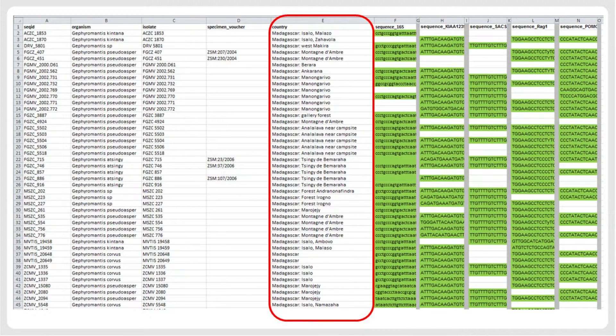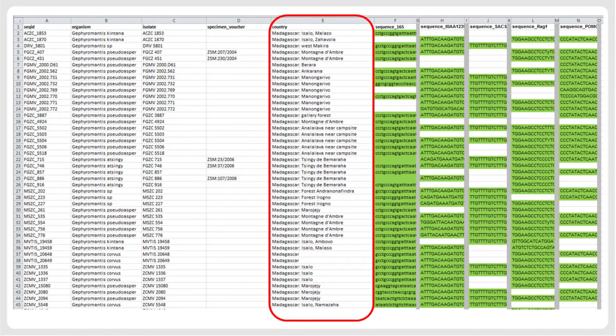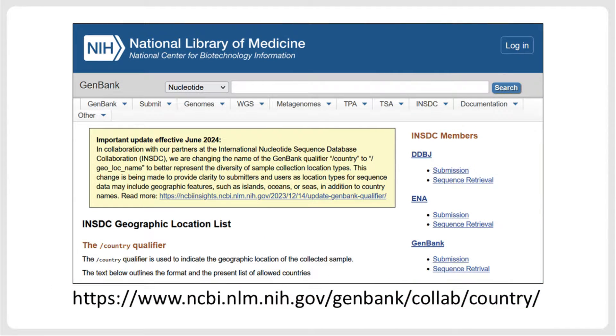In addition to the information on isolate or specimen voucher, it is also necessary to specify information on the geographic provenance of the samples. This is done using the source modifier called country. Here, the country is given first, followed by a colon and the specific locality, which should always be provided when available. The GenBank documentation website provides a list of accepted country names, and it is mandatory to write country names exactly as required.